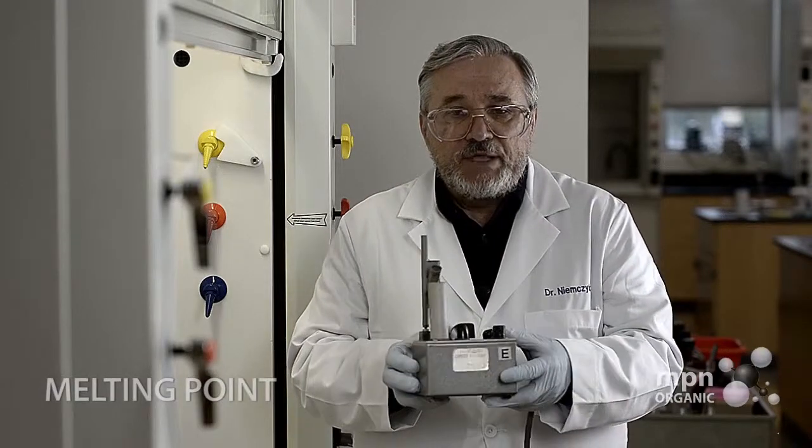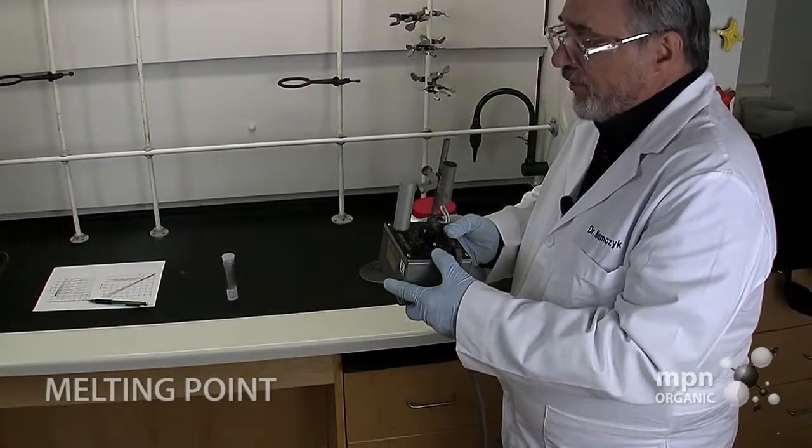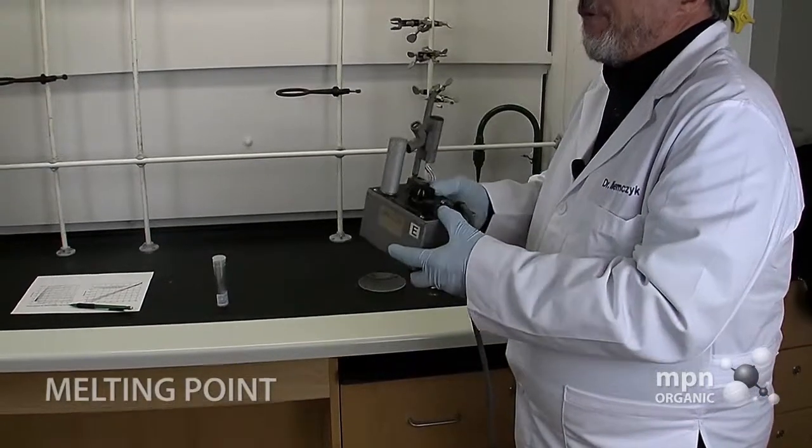The device that we're going to use is what we call the MeltTemp. We have two varieties of this MeltTemp in the lab. This is the older of the two varieties, but it performs this very same function, and we're going to be using that.